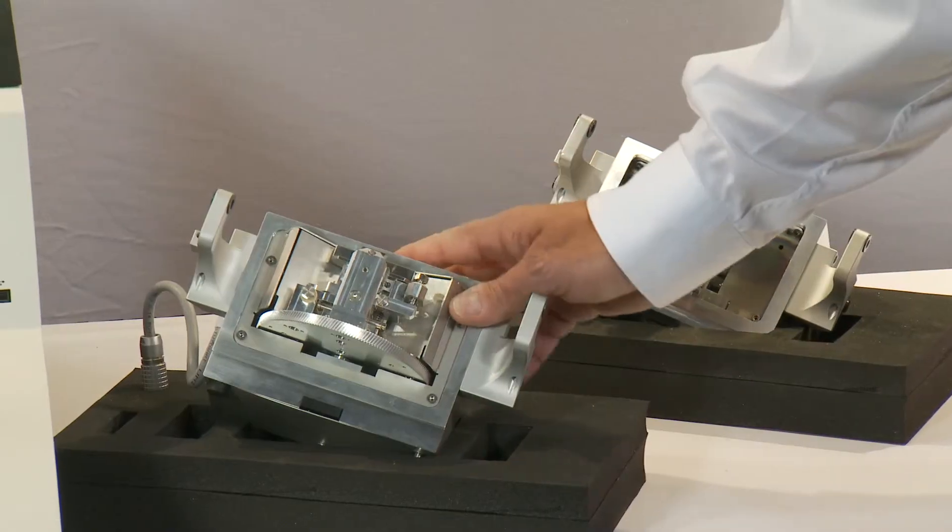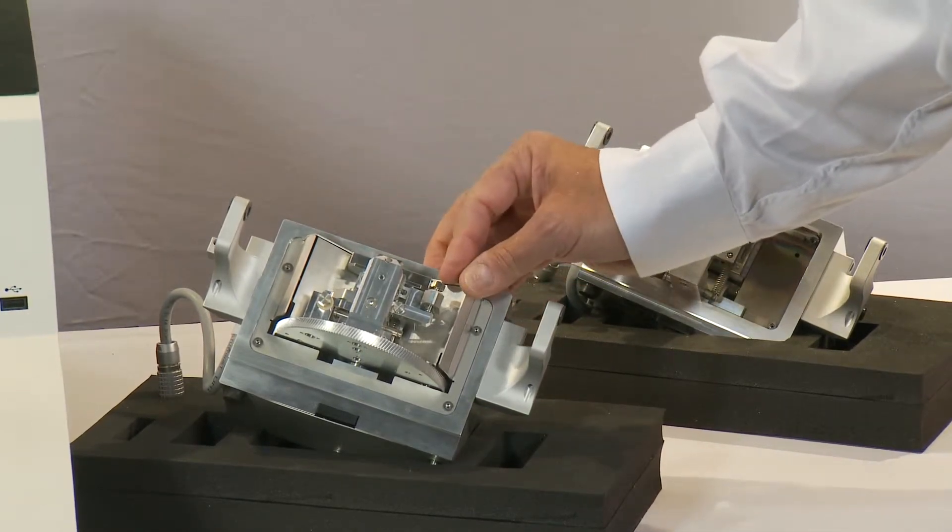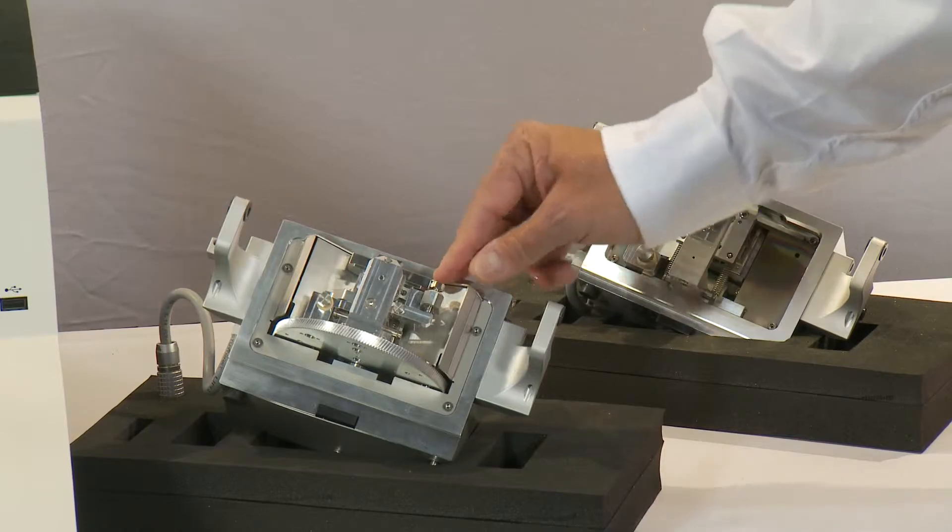Together with our three-position stage here, you can put three samples together into the milling system and run them overnight in a single process.